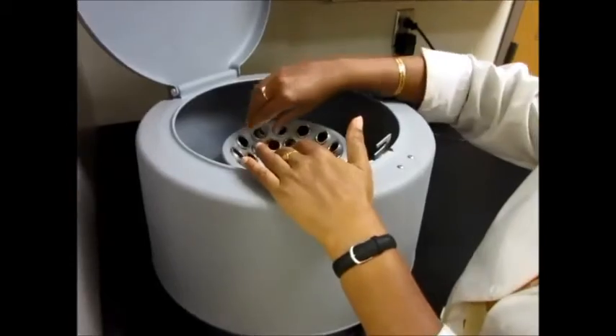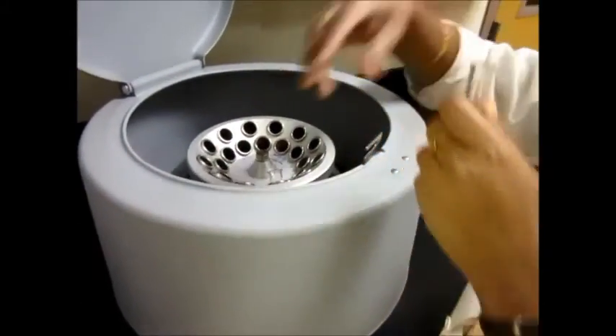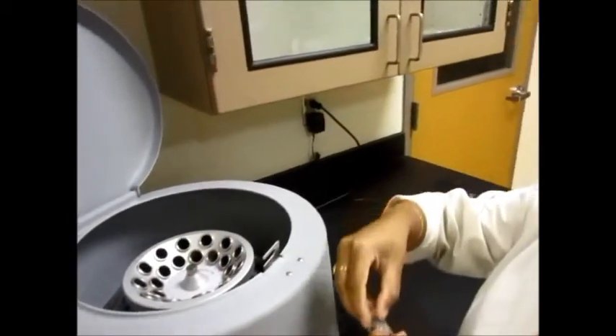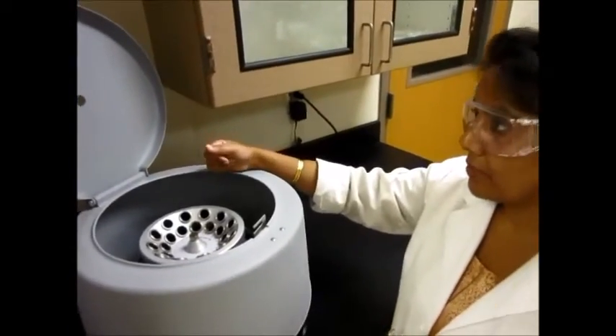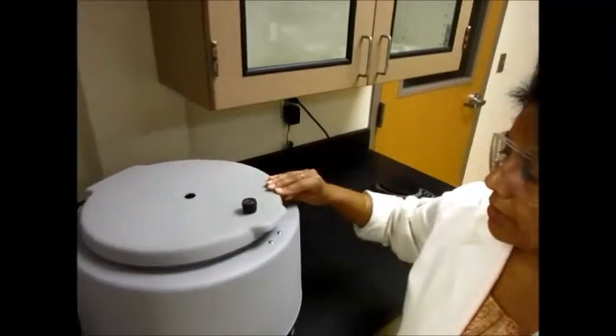Now we can take our test tubes out. If both of them belong to you, take yours out; if not, whoever else is working on it can take theirs out too. Once you're done, close the lid and you are done.